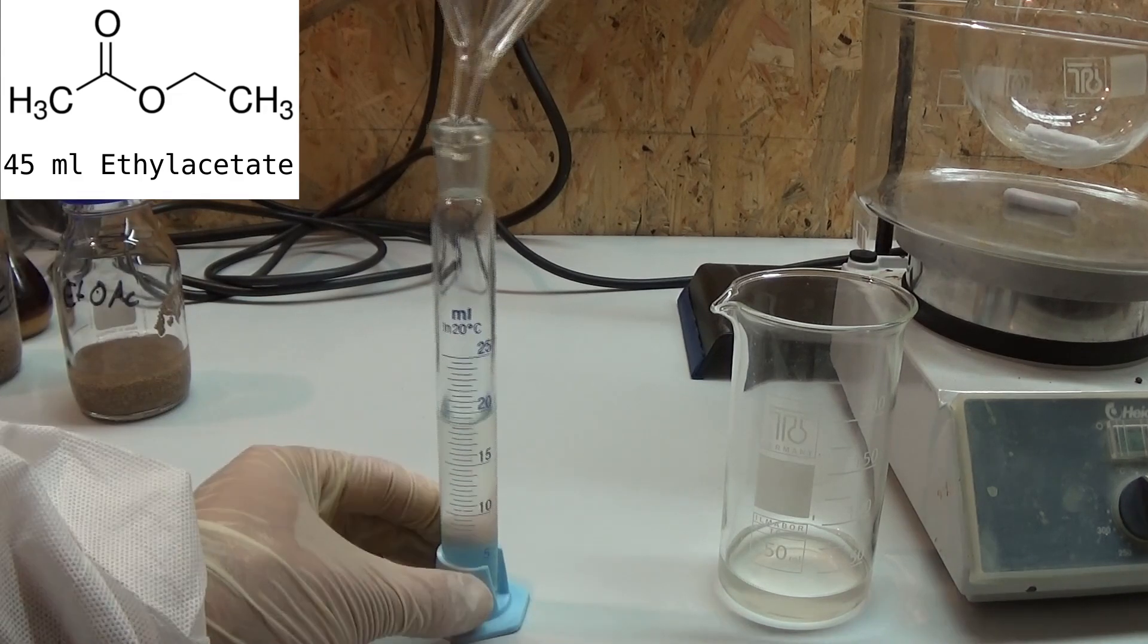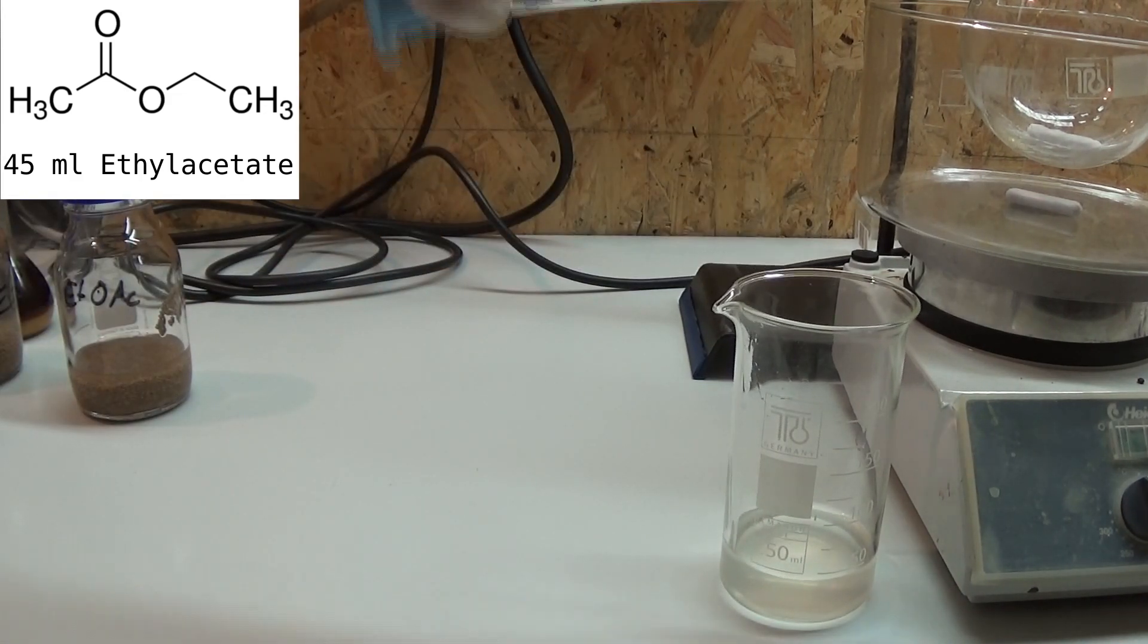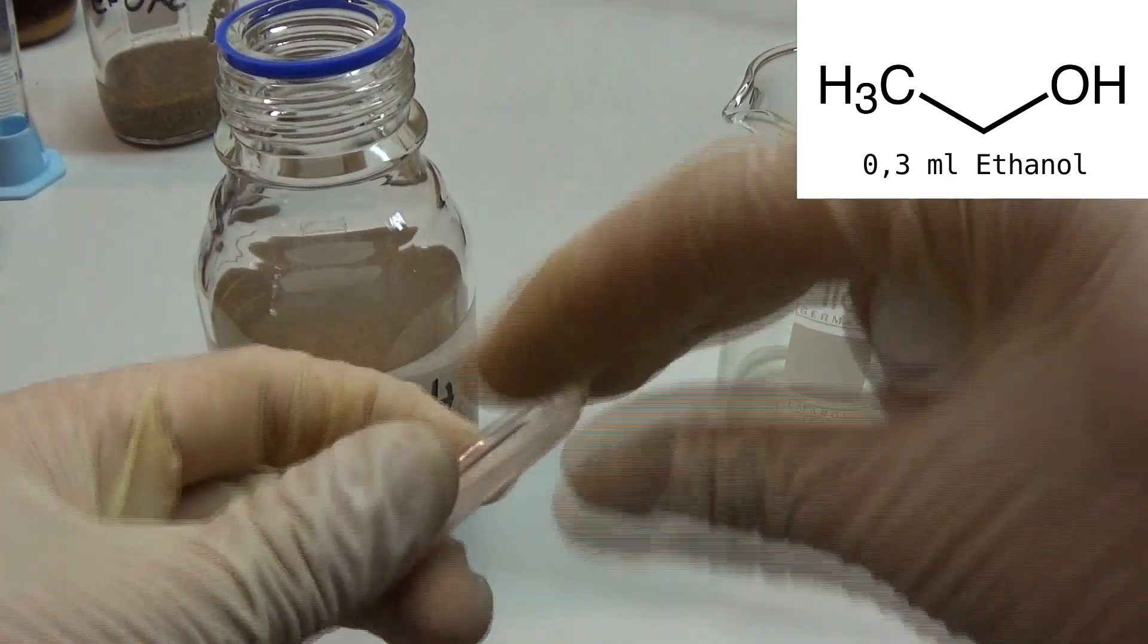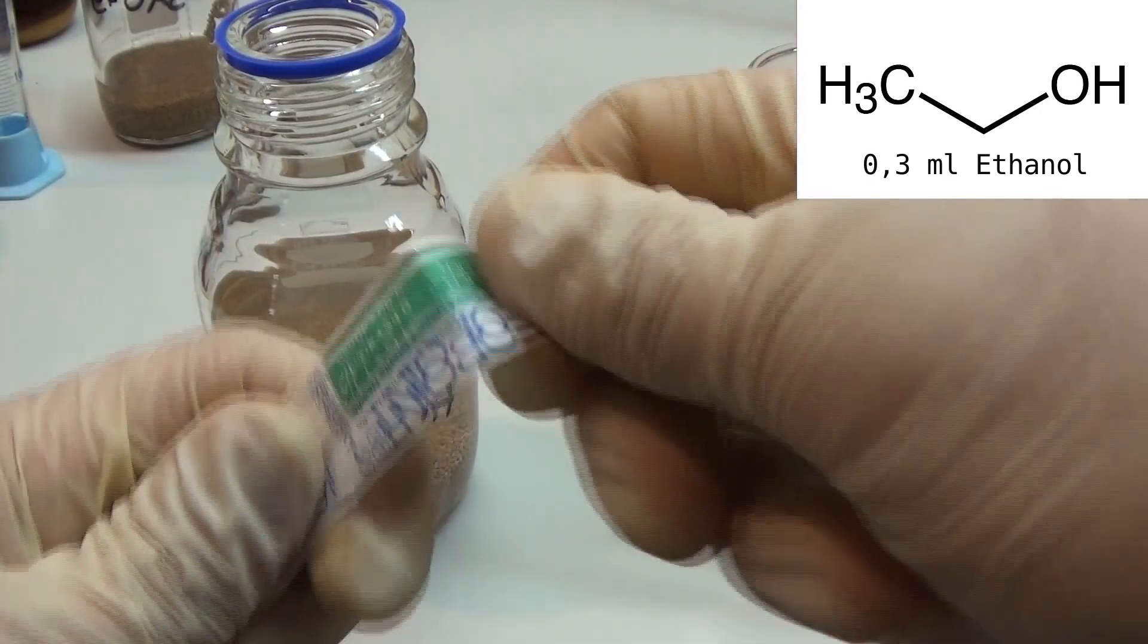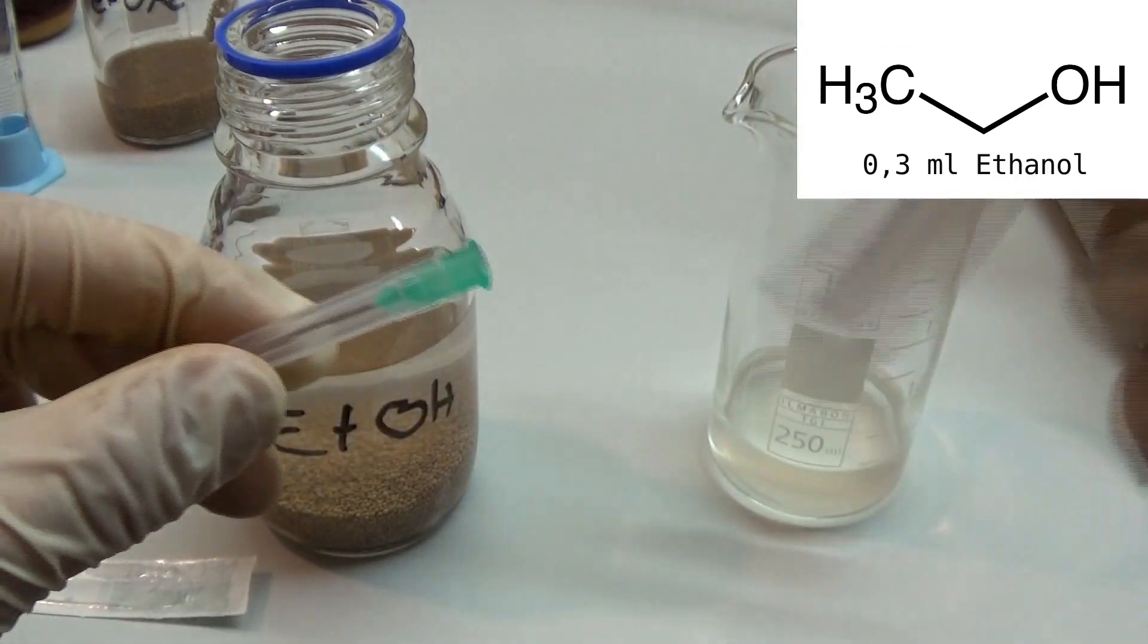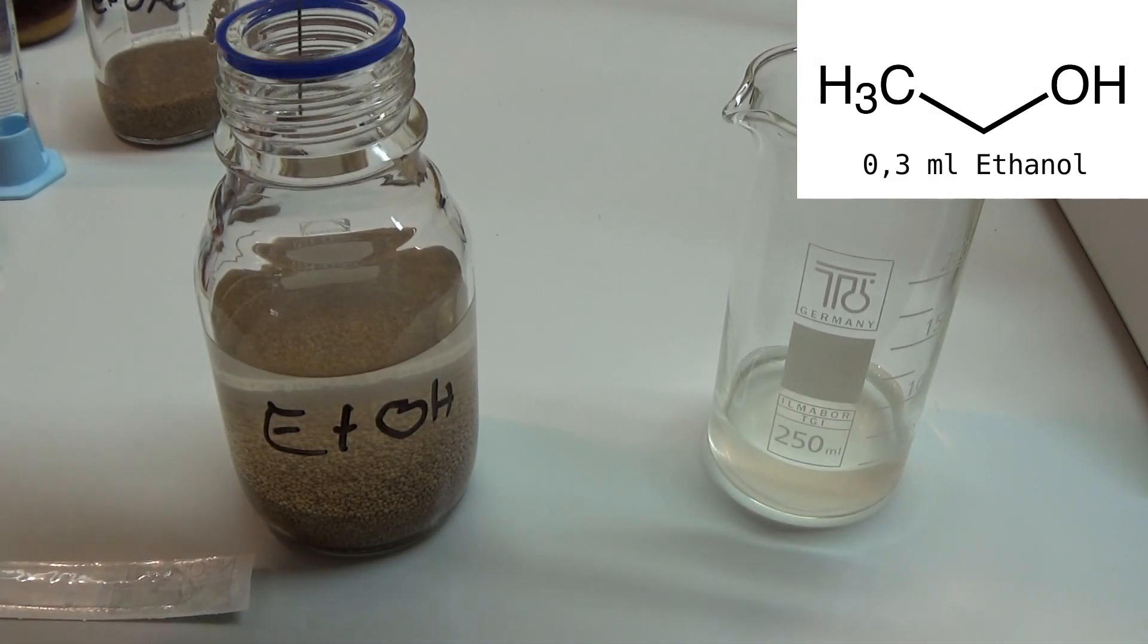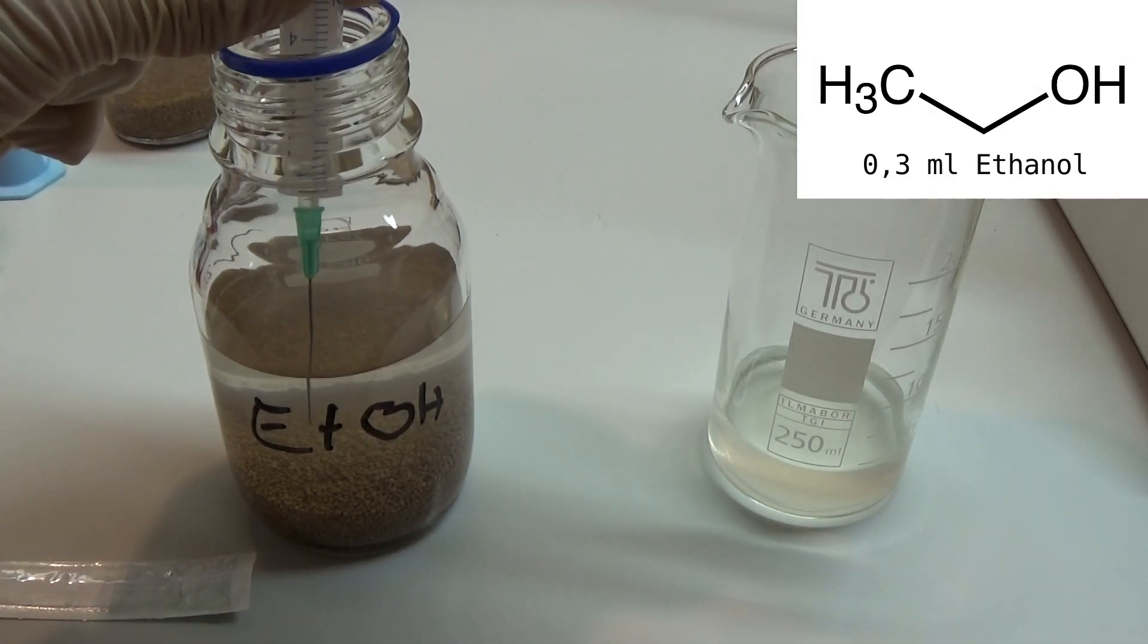Now for the second part of the catalyst: ethanol. The EtOH was also pre-dried using molecular sieves to ensure no water was present. We only need a small amount of ethanol so I measured 0.3 milliliters out and directly combined it with the ethyl acetate.